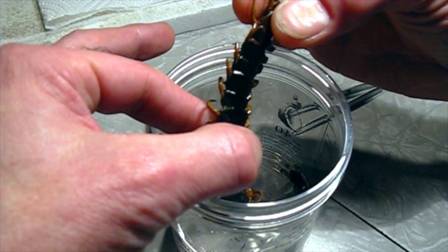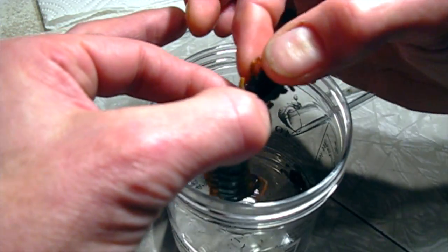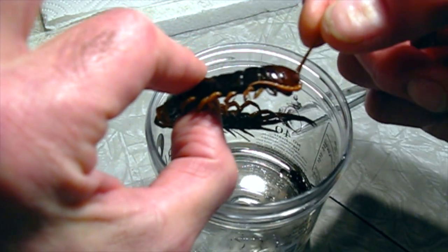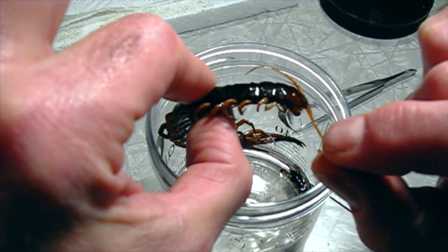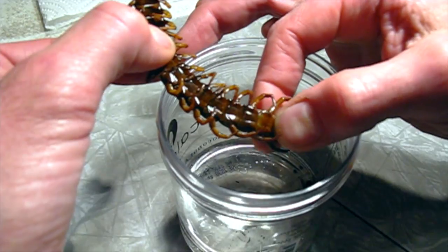There's a lot of legs here, and the legs themselves are relatively soft too, so they can get kind of curled up. And the antennas are also very flexible and tend to get curled up and, you know, sort of out of shape when they dry.